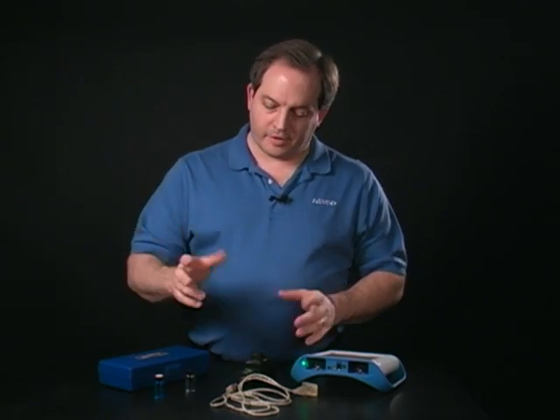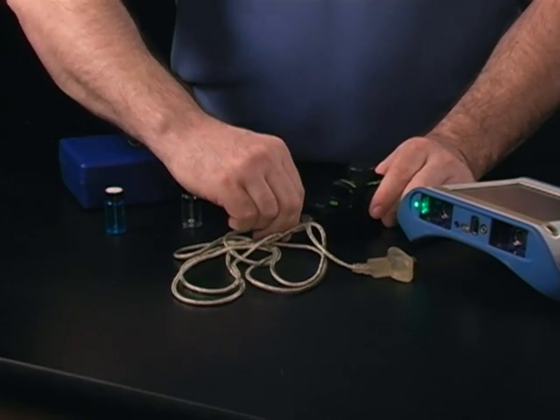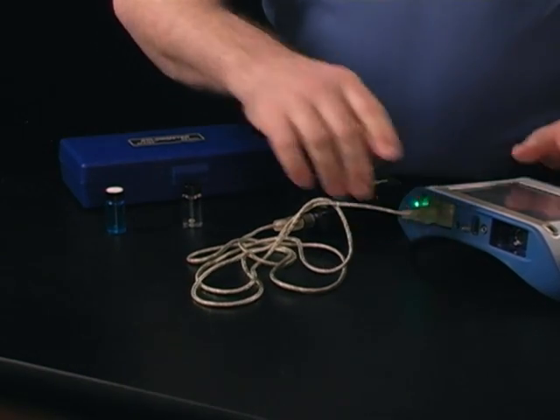To use the colorimeter, we're going to go ahead and connect it to our interface using the cable that comes with it.